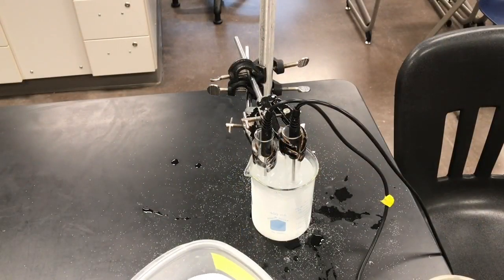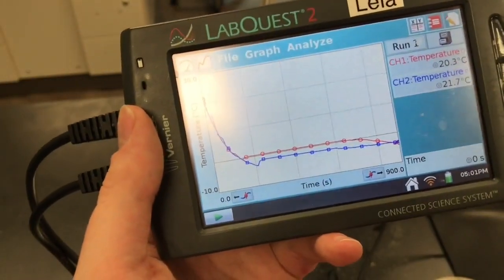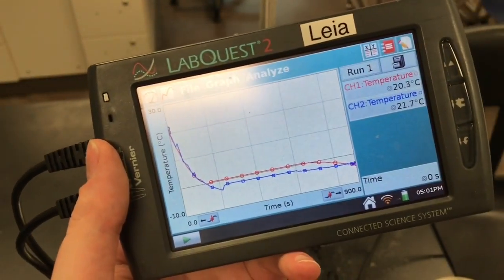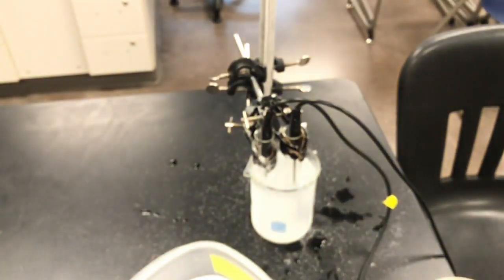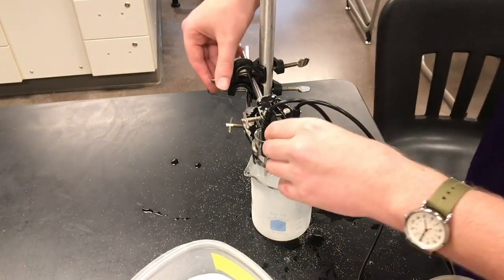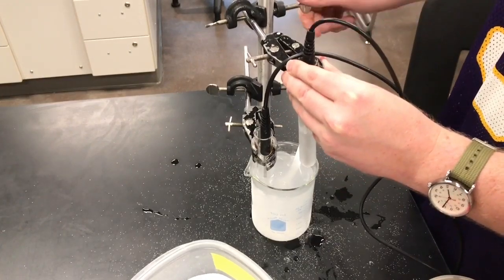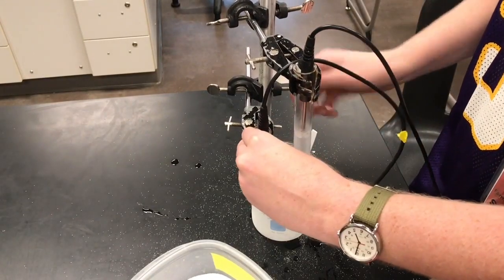Alrighty, after about 15 minutes, your data should look something like that. We'll talk more about that in a little bit. The first thing you're going to want to do, because the cleanup for this lab takes quite a bit of time, is to pull up your test tubes.